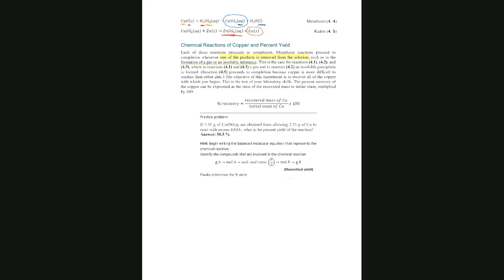When I showed you that invitation for this workshop, I put a beaker. If you saw it when I said looking forward to seeing you tomorrow, there is a blue beaker with a black solid. Okay, the black solid is the copper, but that reaction in the picture is not done. Why? Because I can still see blue, and blue means not all the copper reduced. I need all the copper because I'm trying to do a quantitative reaction. I want to obtain as much copper as I can. So either I need to add more zinc, but I have to recover all the copper.